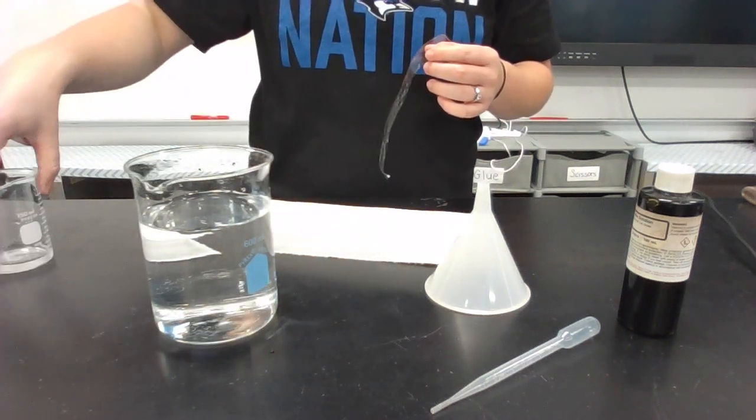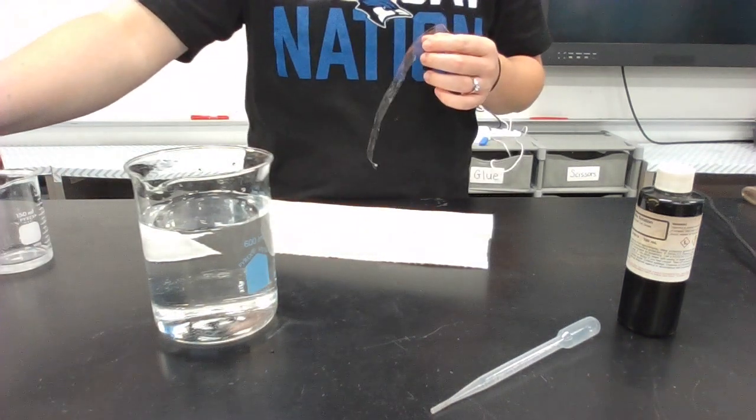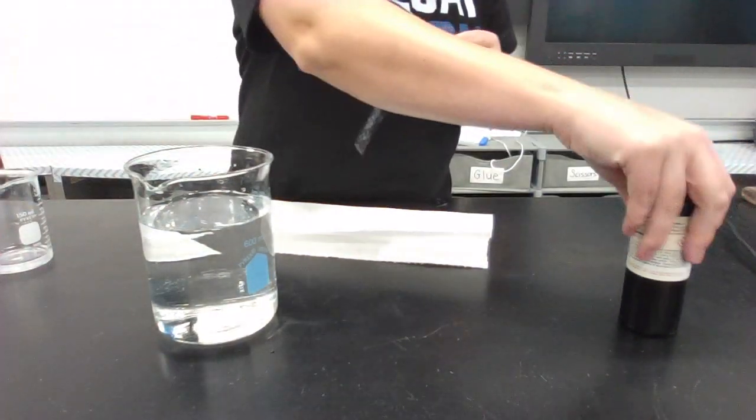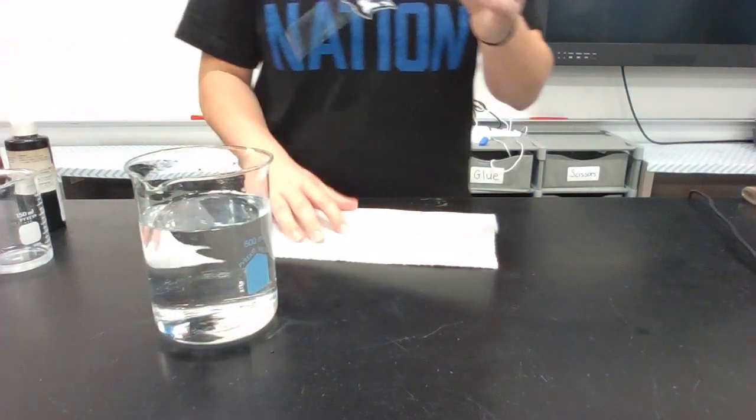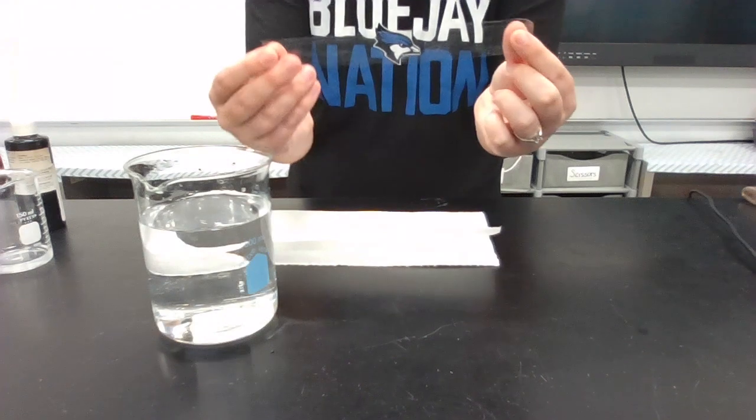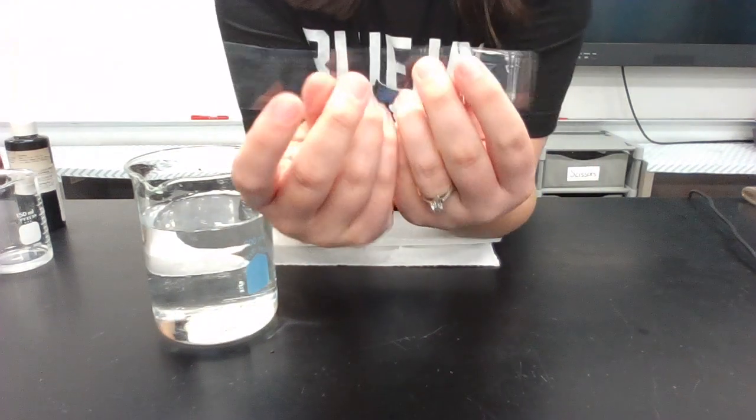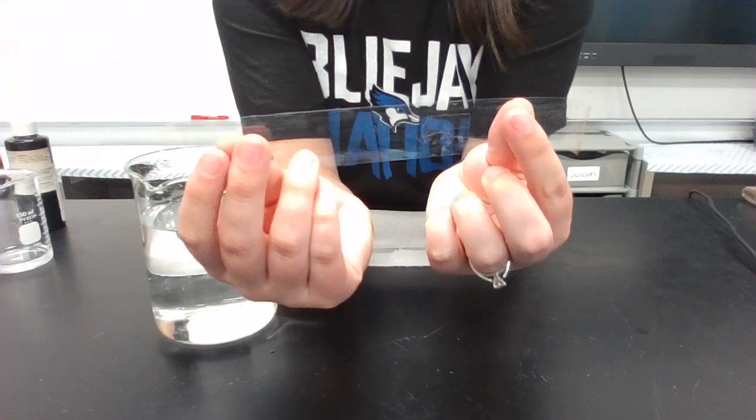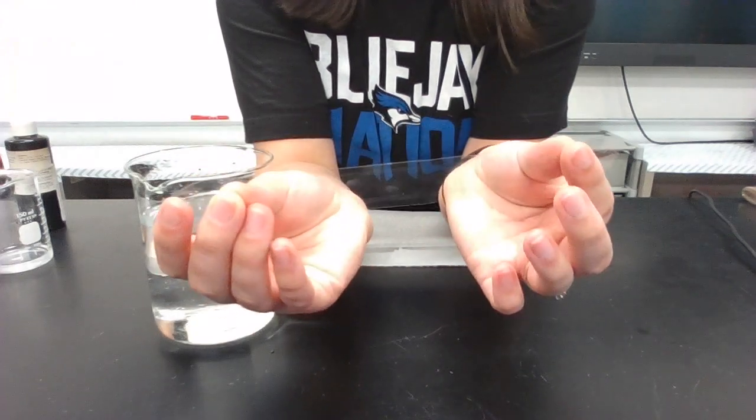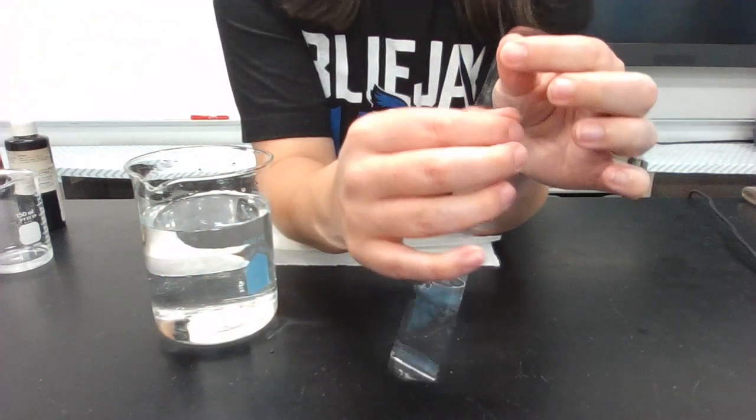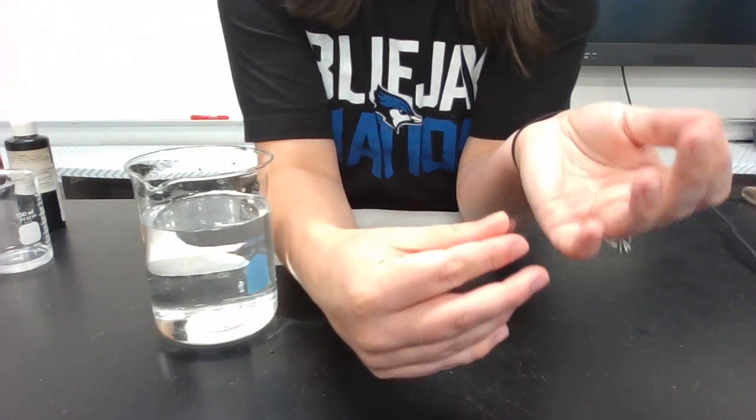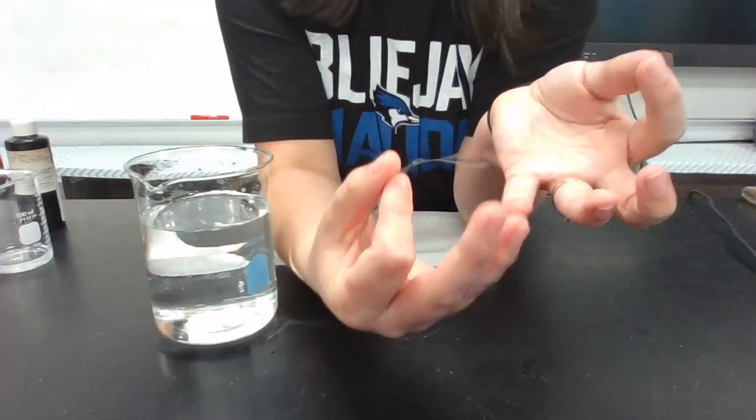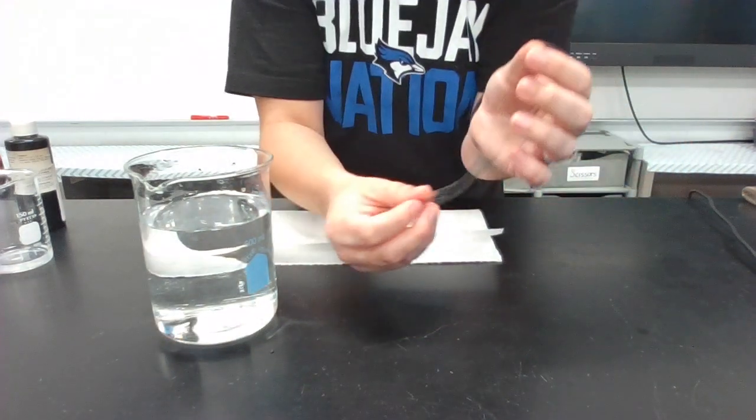So let me move these out of the way. What I did was I took the dialysis tubing and cut a small section off. You can hear the crunch of it. It's not a very pliable material, but if you know anything about dialysis, that's whenever you clean the blood because you filter the blood. Your kidneys don't do a very good job of it.